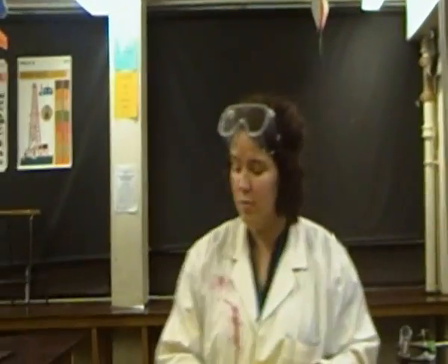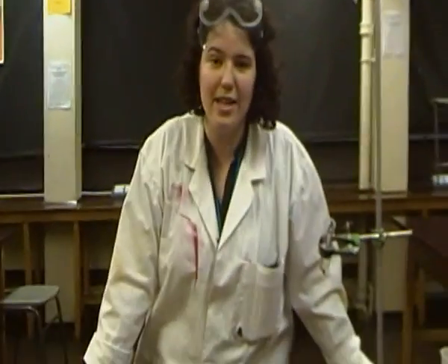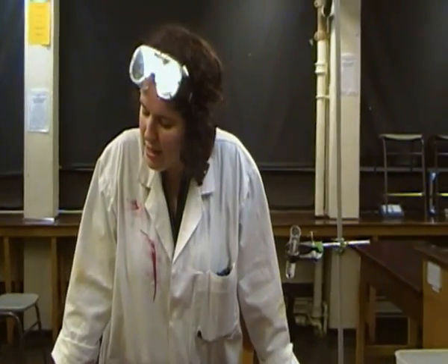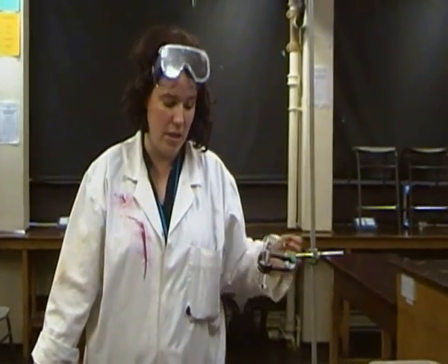Okay, so the last one, well done for getting this far, is investigating fuels. The point of this one is that students investigate the mass of different fuels, remember mass means weight, needed to heat a fixed volume of water.